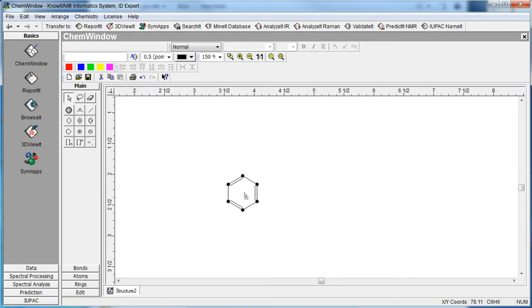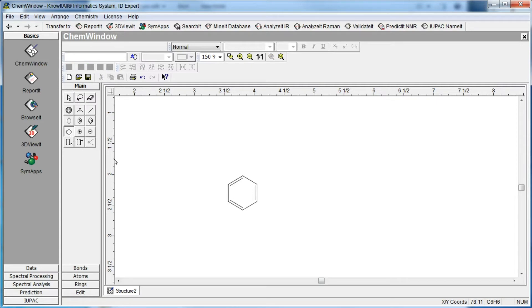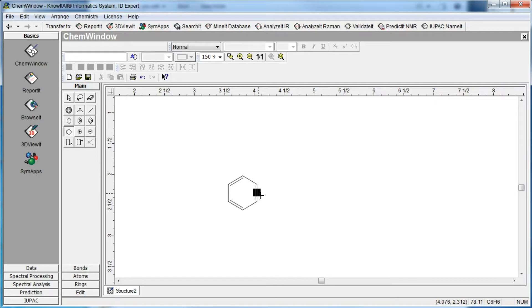Next, select the cyclopentane tool, then move the cursor to the hitbox on one of the bonds on the benzene ring. Hitboxes are snap-together points located on every atom or endpoint, on all bond midpoints, and on every character in a label.